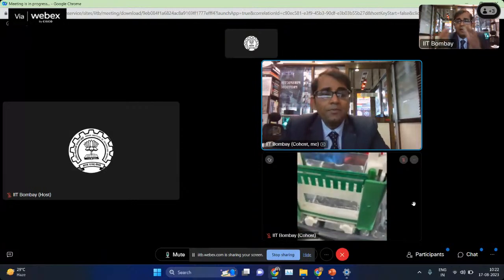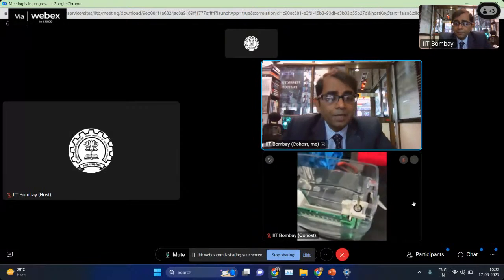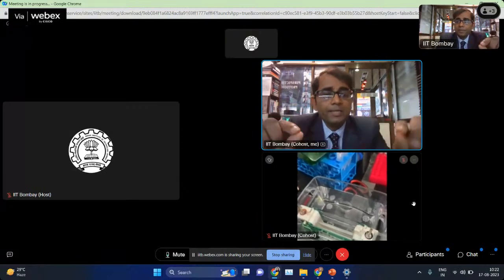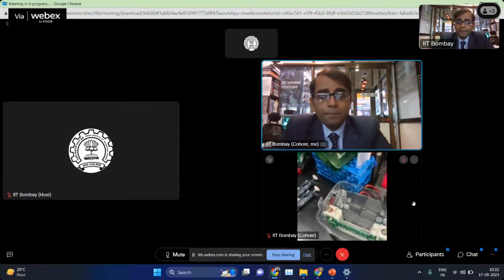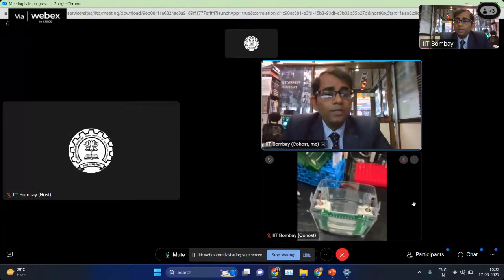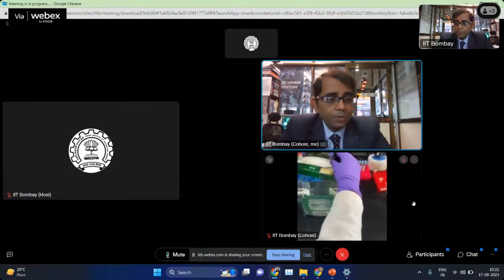But we also have additionally very large running units, which is known as the standard 6 unit, where you can run 6 large 2D gels at the same time. And this kind of large IPG strip can be placed over there. But irrespective, the concept remains the same. You can place your IPG strip on the SDS-PAGE unit, and then you can separate it based on the molecular weight. Once you have completed the second dimension separation, then you can take out the transparent gel, and you are going to further stain it with Coomassie or silver or any kind of staining solution.